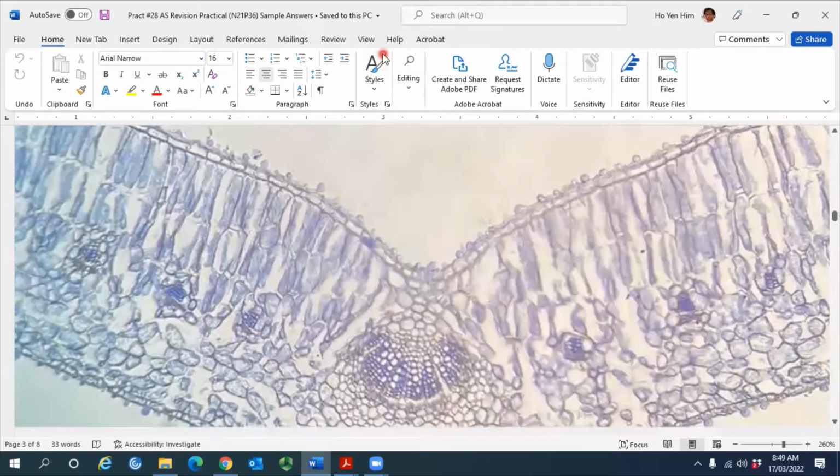And then the student said, teacher, I don't know how to draw the borderline between xylem and phloem. Use color to help you and use the shape of the cell to help you. So in this vascular bundle, you can see that this is very dark. This is not so dark. So this is the line. Finish. Once you know how to draw this, you know how to draw the rest of them. It's roughly the same. You see here, this one is very obvious. This is dark. This is lighter. So the borderline is here. Maybe the lighter one is cambium also. Okay, so use that one to help you.